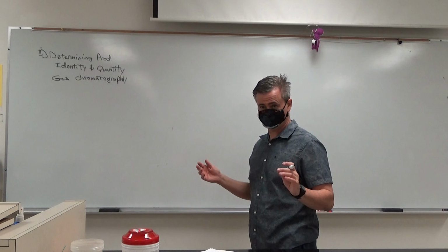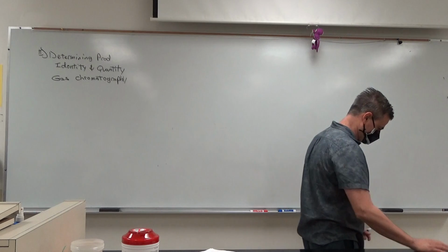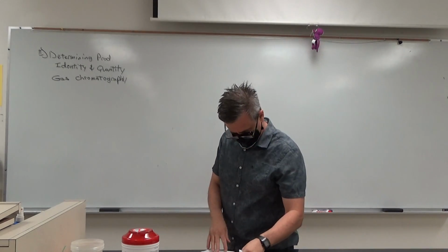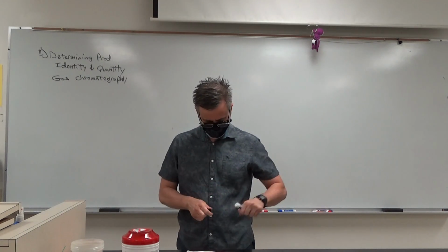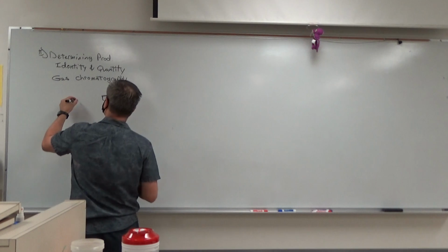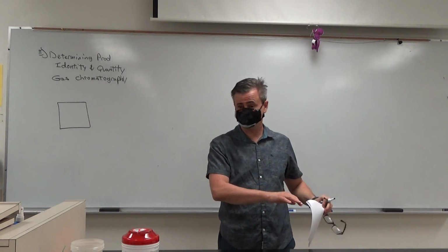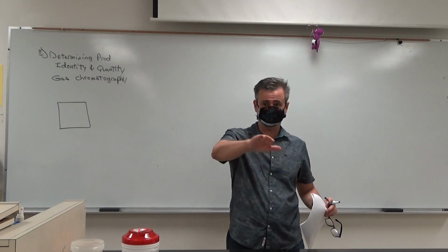It's very crude, oversimplified, for sure. We have everything heated. It's often heated in a ramped type of way. So it starts out at room temp and then ramped.